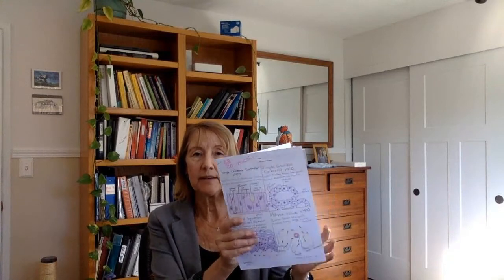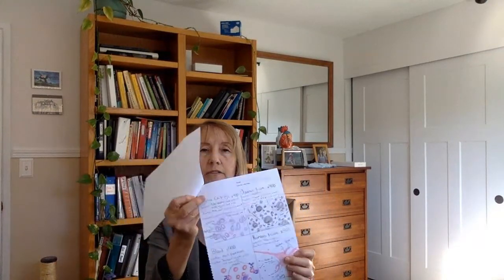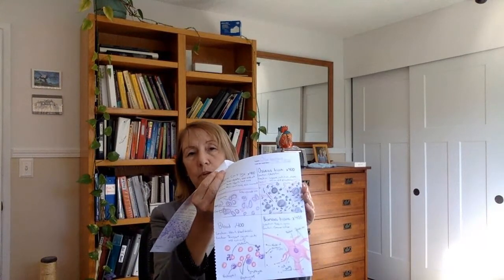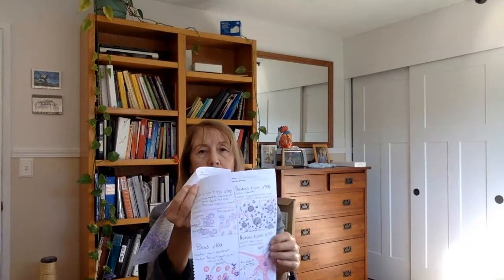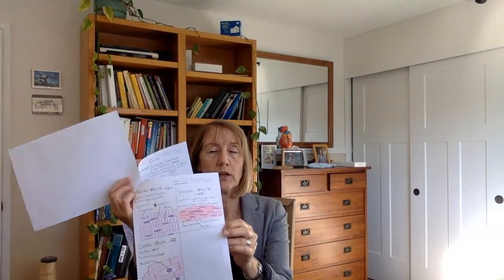So it ends up being about 3 pages worth of these different drawings, and these are beautiful, that are done over the period of 2 weeks. So you'll have 2 weeks to do these. You'll do 6 on the first week and then the other 5 on week 2. So let me show you another example.